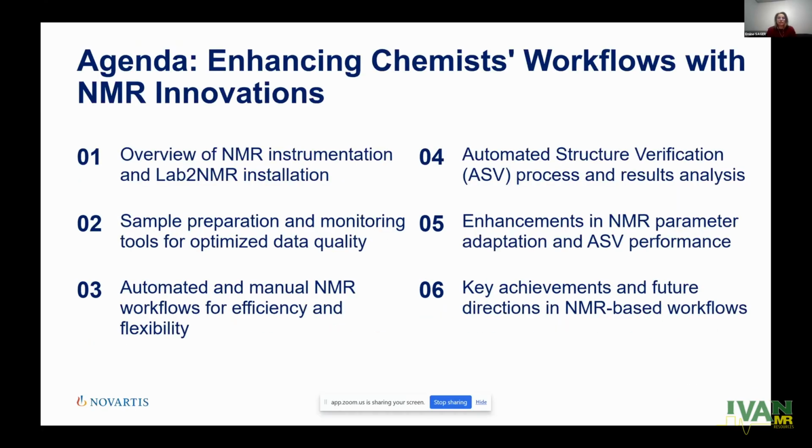First, the agenda. Today, I will go through first the overview of the NMR instrumentation that we have and the Lab 2 NMR installations. Then I will give you the sample preparation and the monitoring tool that we have to optimize data quality. We will go through the different workflows that we have at Novartis. I will show you how we integrate ASV, and then the enhancement in NMR parameter adaptation and ASV performance, and give you some key achievements that we have with this workflow.